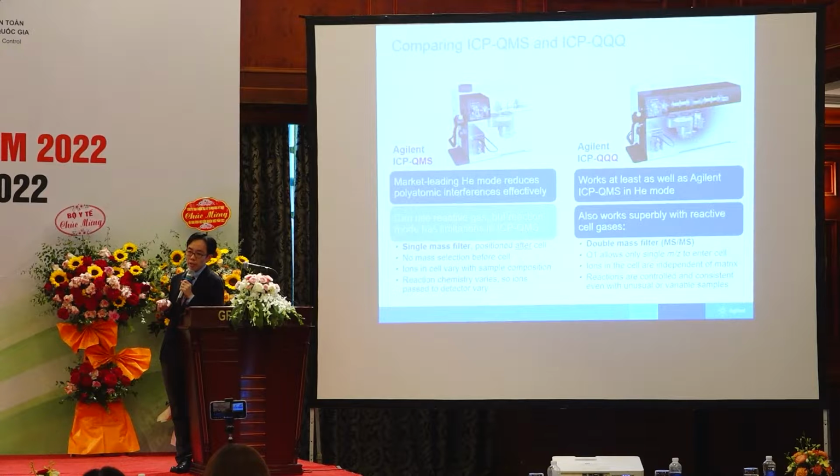How we operate our triple quad, typically we will operate it with a reaction gas. The importance of triple quad is not just the number of quadrupoles. Some vendors say they have 3 quadrupoles, some vendors say they have 4 quadrupoles. Maybe in future they'll say there's 5 or 6 quadrupoles. It's not important. But the importance of ICP triple quad is the ability to operate in MS/MS mode, or in chemistry terms, tandem MS mode. That is the critical part of a triple quad.